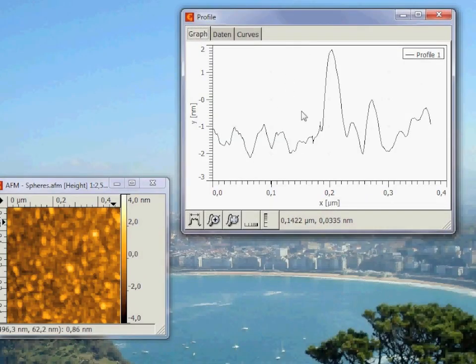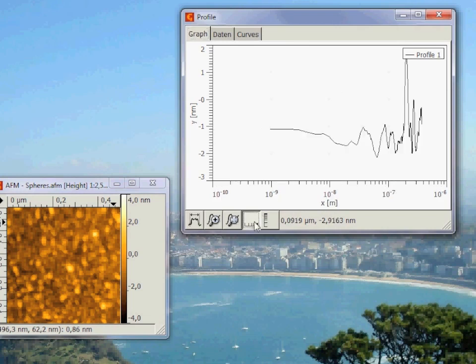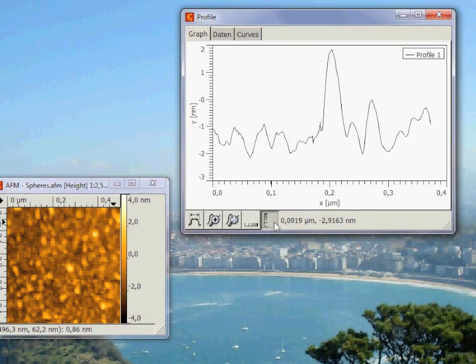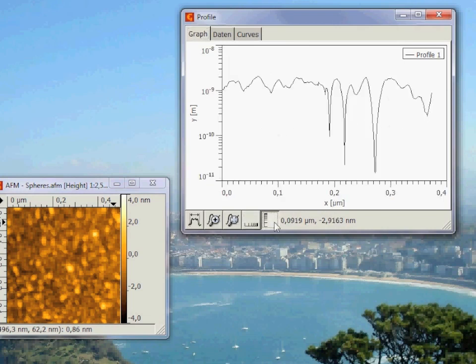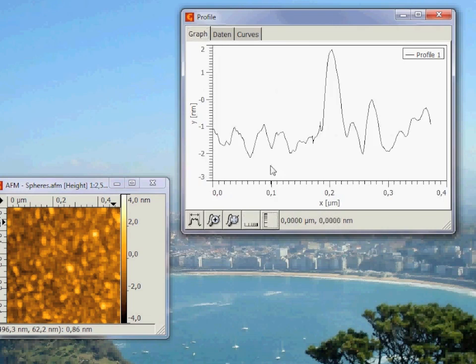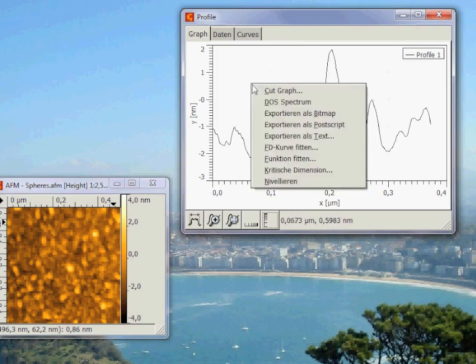You can plot the profile logarithmically in X and Y axis. A nice feature is the right click on the profile. Here you can select and do different things.